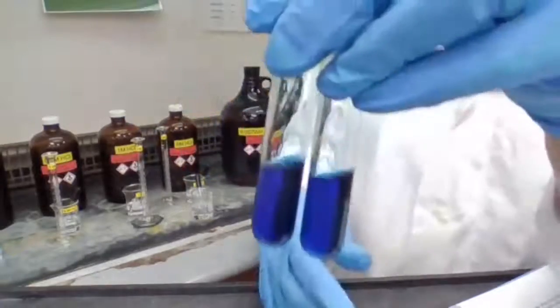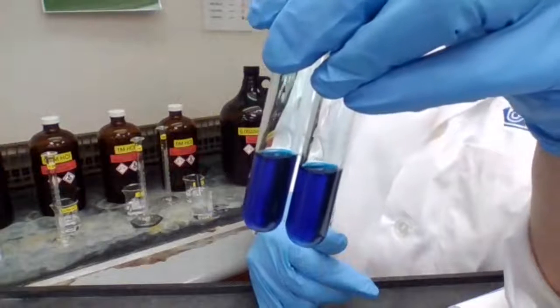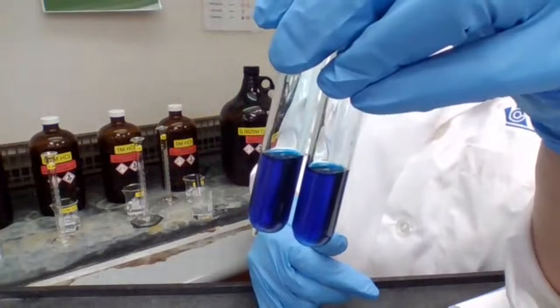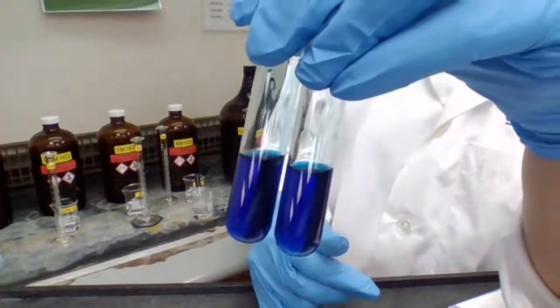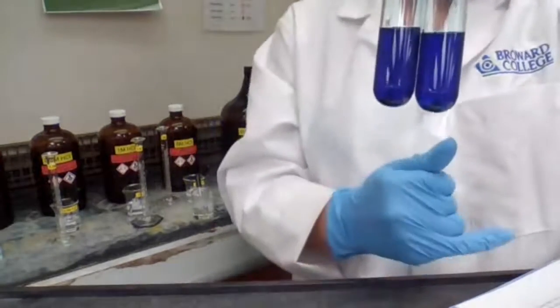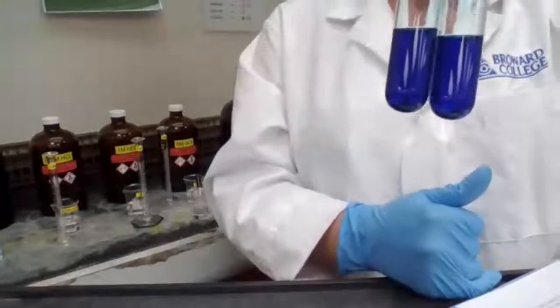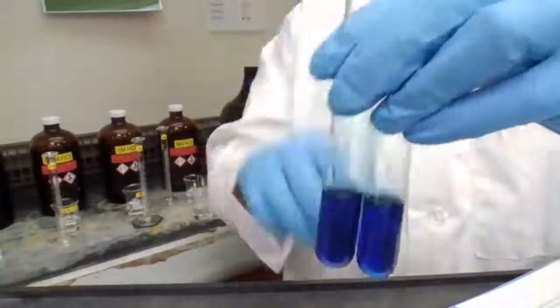I want you to record your observation after adding HCl to both test tubes. Now, I'm going to take only one of the test tubes.